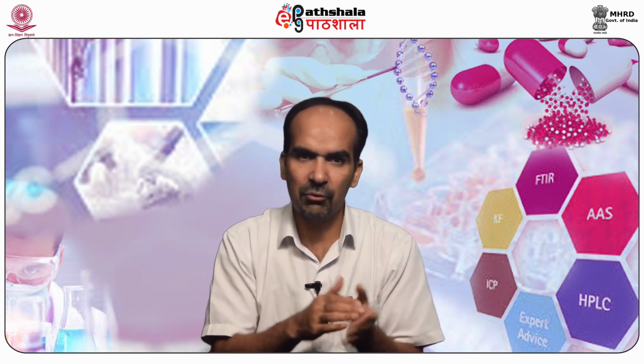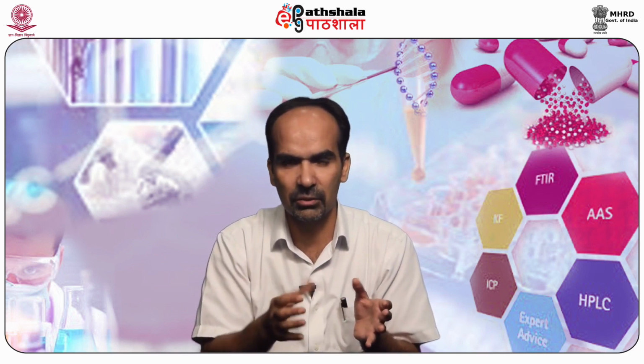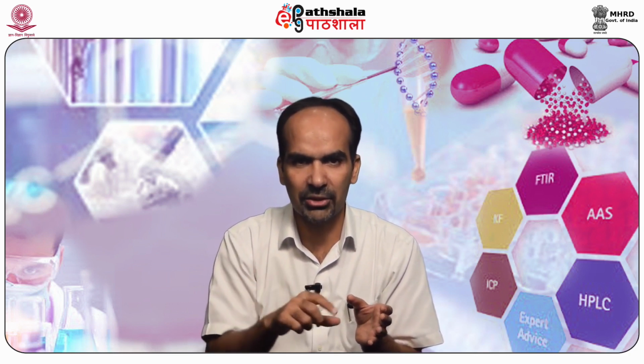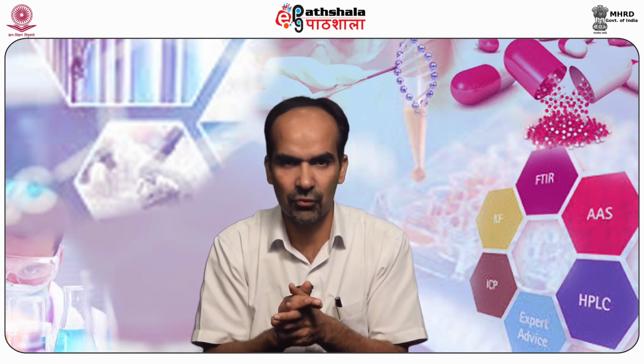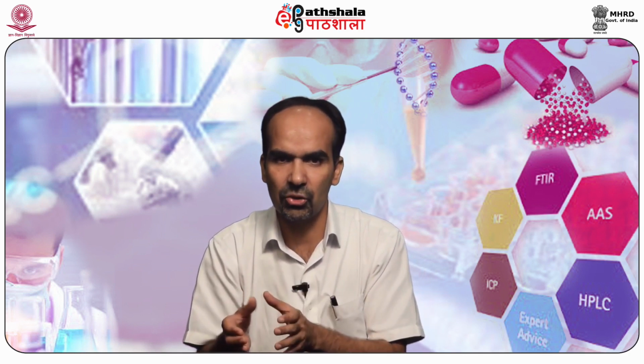Number 2, we extract the mixture with chloroform in successive portions by shaking 20 ml each time, twice, for 2 minutes, washing each extract with the same 5 ml of 1N H2SO4. Retain the two aqueous solutions separately and add to each solution 2.5 ml of sodium hydroxide solution.